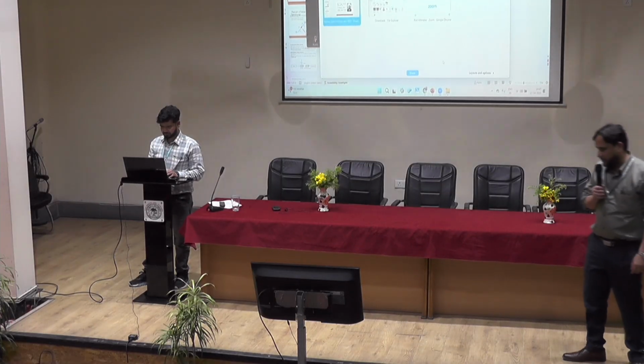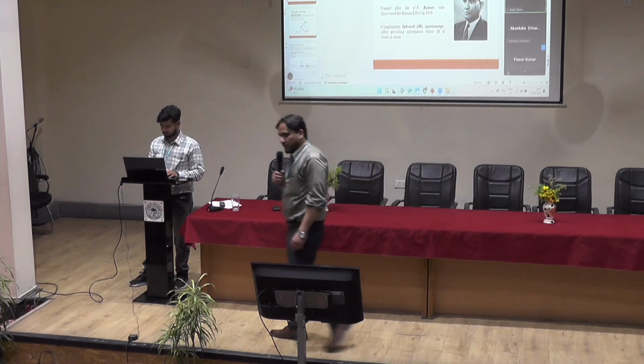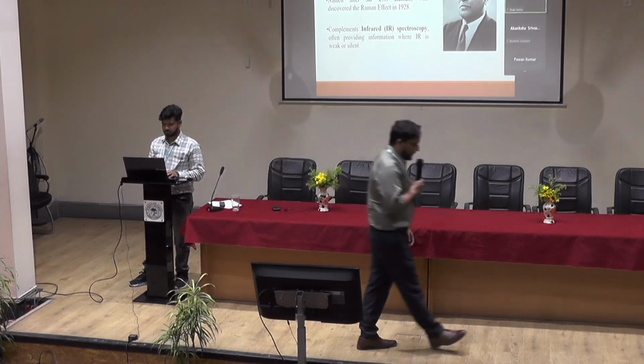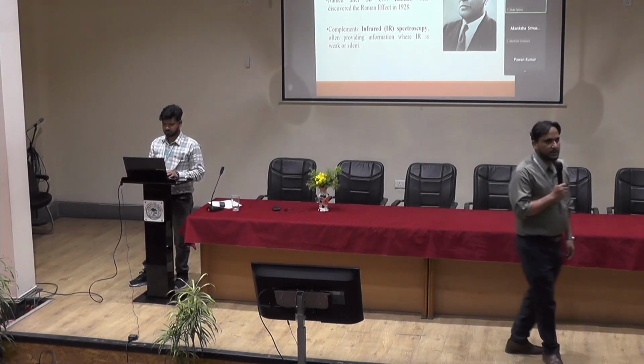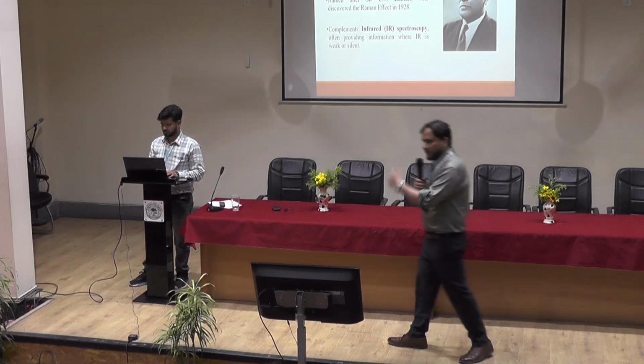XRD, X-ray diffractometry, is basically used to study the crystallinity of a material, the particle size, the geometry, the phase structure. What we generally do in X-ray diffractometry is that, I want to give you brief information before you go and see the equipment.